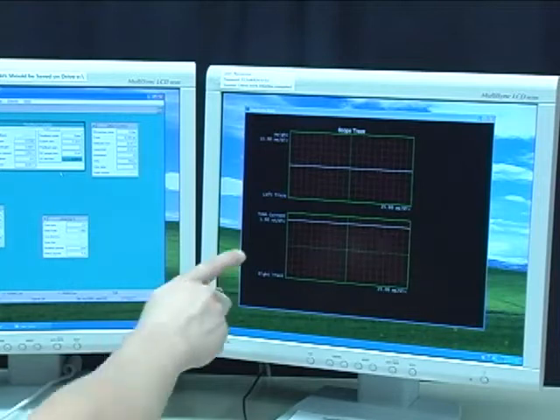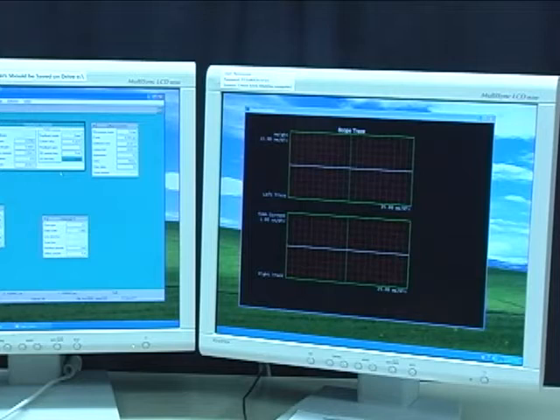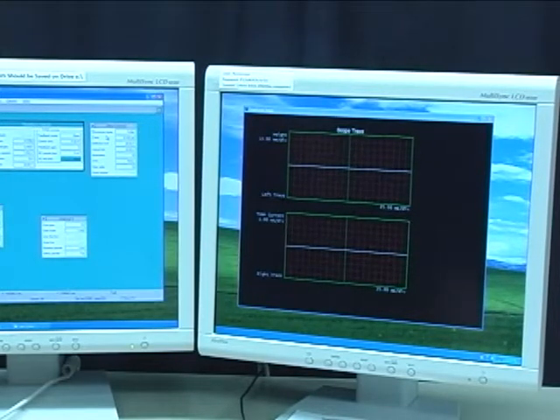So now it reads 4 nanoamps. So we can turn our bias off. It goes back to zero current. So we know that our amplifier is correctly zeroed and has the appropriate response.